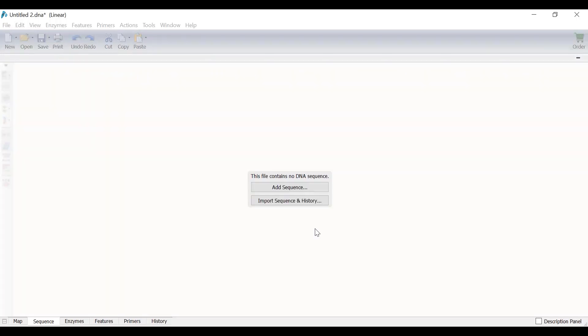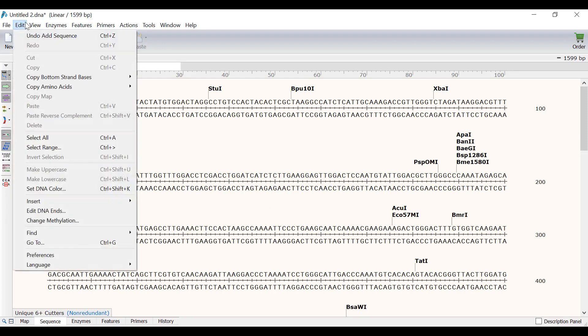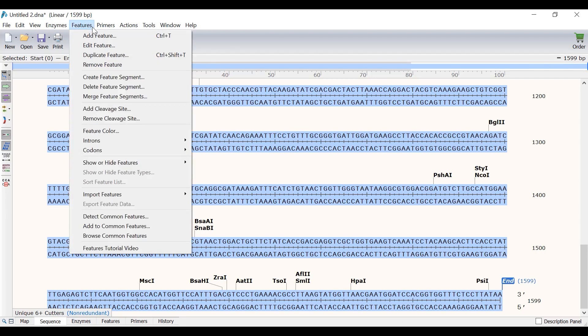To start with, I will create a new feature containing this whole sequence. To do this, I will go to Edit, Select All. Alternatively, I can press Ctrl and A on my keyboard as a shortcut. Now, I will go to Features, Add Feature.